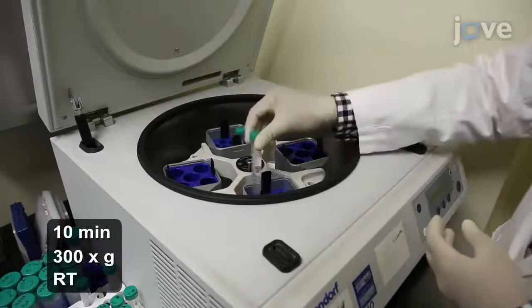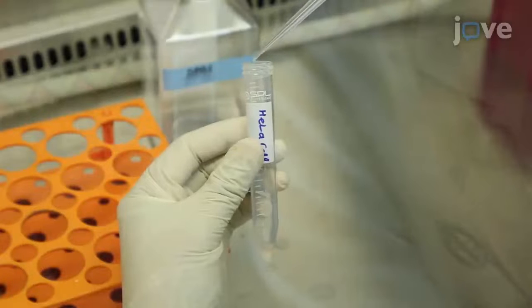Collect the cells by centrifugation, followed by 2 washes in 2 mL of cold PBS per wash.